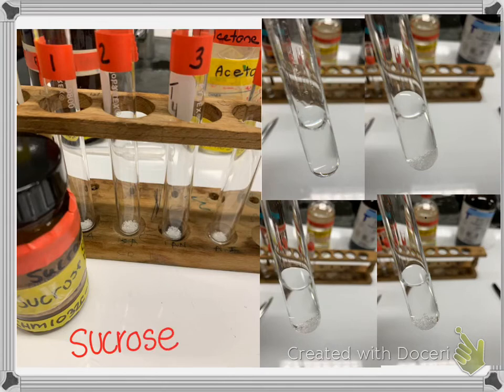And so I have 4 test tubes, 1, 2, 3, 4. This is with water, ethanol, acetone, petroleum ether.